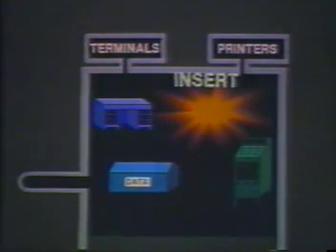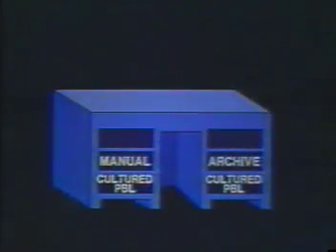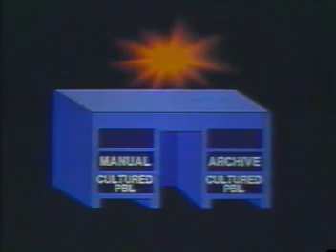If you give the insert command when all of the drawers on your desk are closed, the secretary will understand that you wish to add a new drawer onto your desk. To prepare a new drawer, the secretary essentially takes dictation at Tom's desk. It prompts him to indicate whether he needs a book drawer or a protocol drawer.